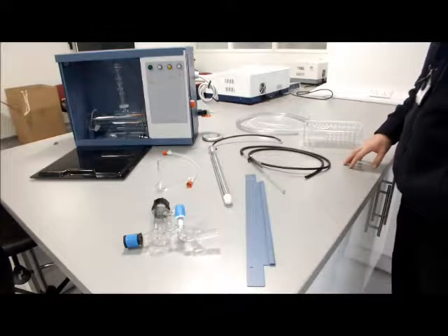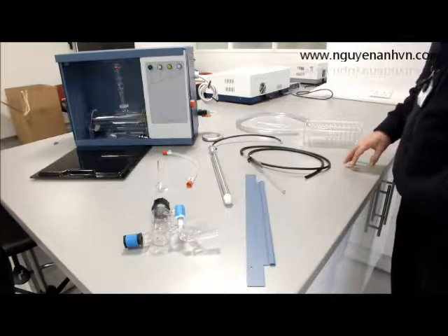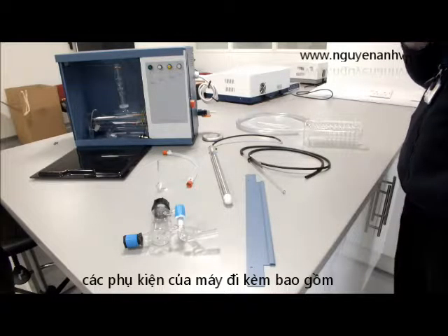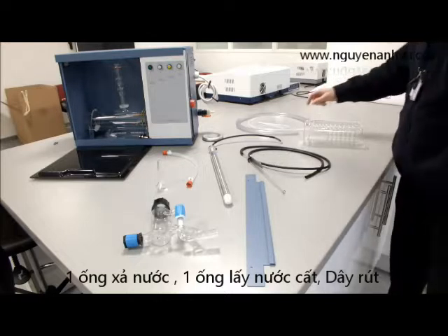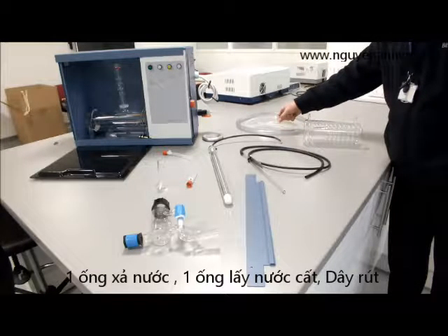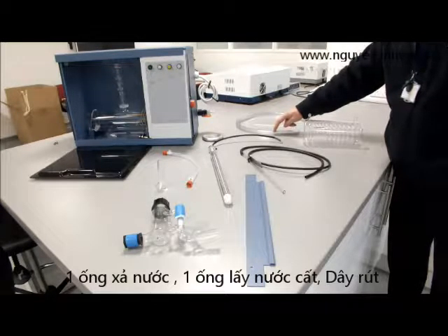This video is about the installation of the Stuart Aquatron A4000 water still. The first thing that needs to be checked when unpackaging the unit is to check that all the parts are actually in the box. Starting with the hose kit, which consists of a 16mm hose, an 8mm hose, and two tyre wraps. Each one of these is one metre long.